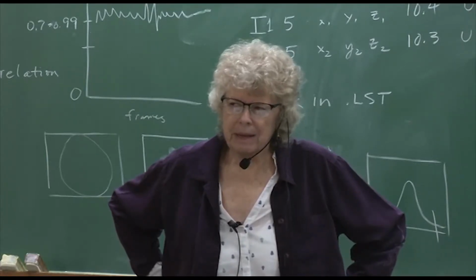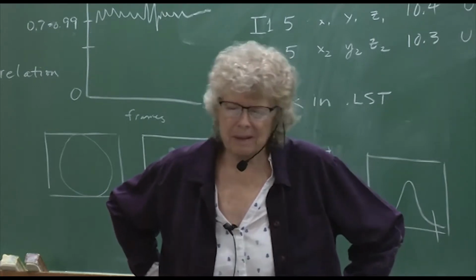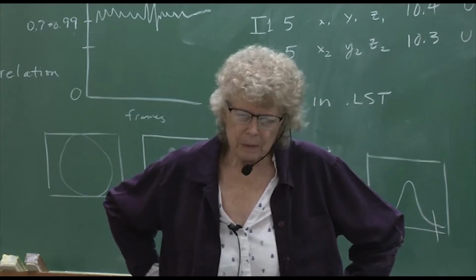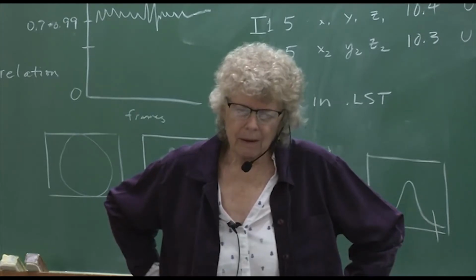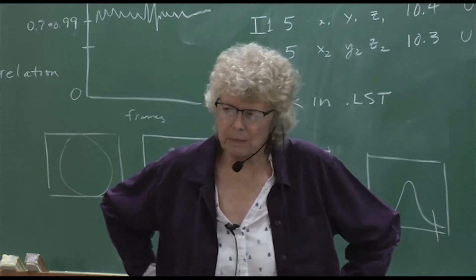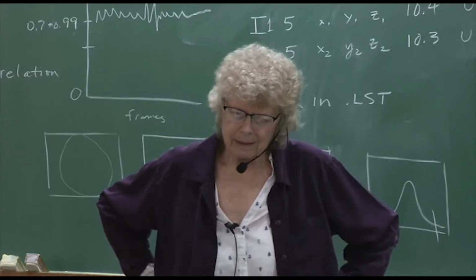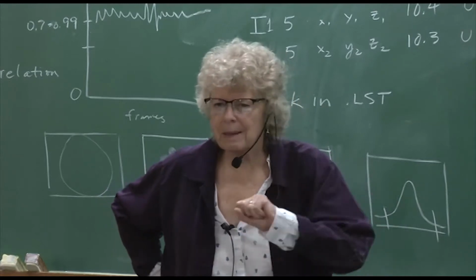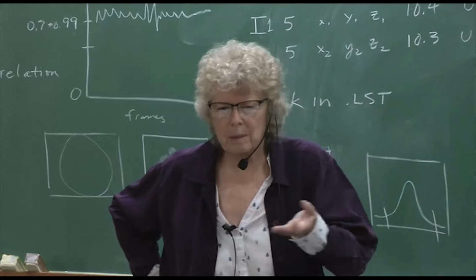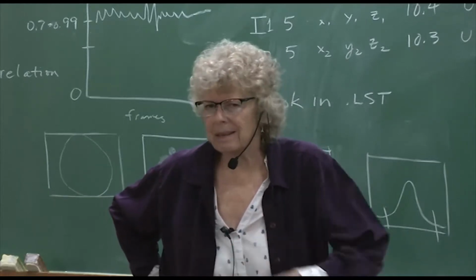There is a distinction made between restraints and constraints. I don't want to go into that, but it's in the manual. Some restraints are accepted better than constraints. Constraints mean you're really fixing something without allowing any variation. A restraint, there's always some leeway, and that's accepted better.